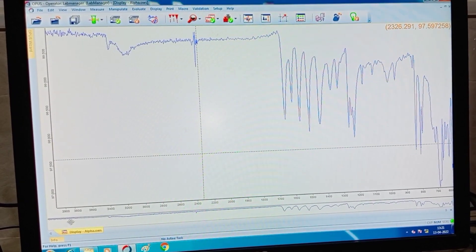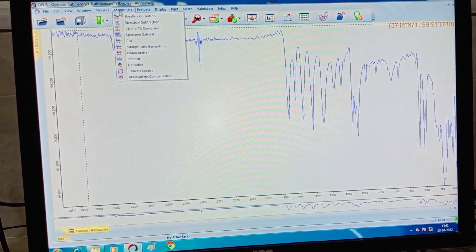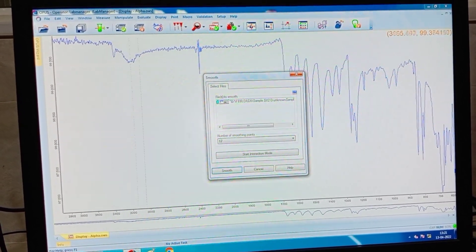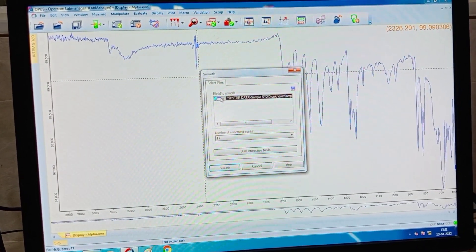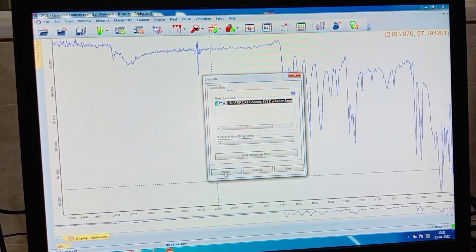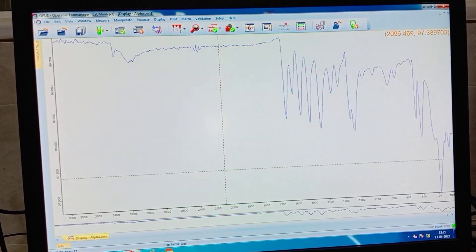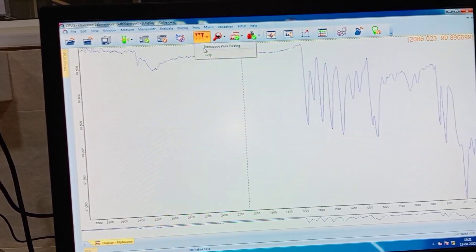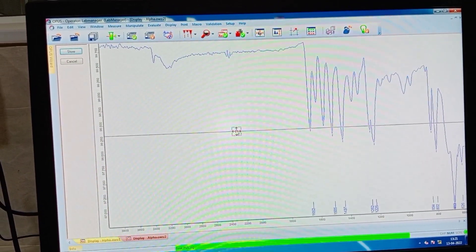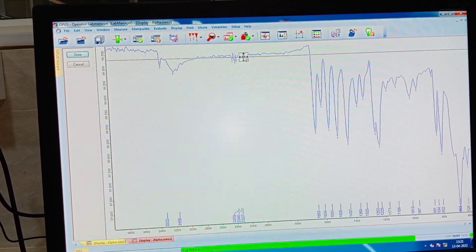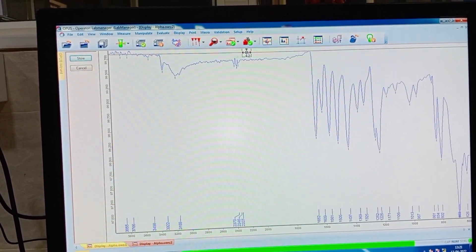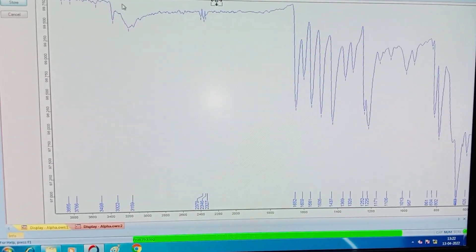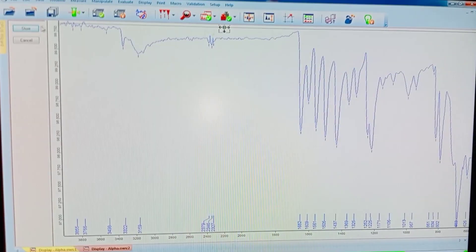We got the spectrum here. Now go for manipulate and do the smoothing of the peaks. Select the file to do the smoothing of the peaks. After smoothing, go for the peak picking. To get the wavenumbers displayed here, we have to go for the peak picking. After the wavenumbers are displayed, we have to store.